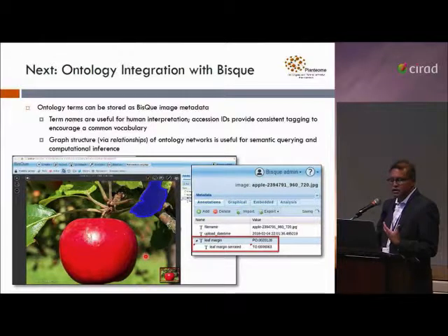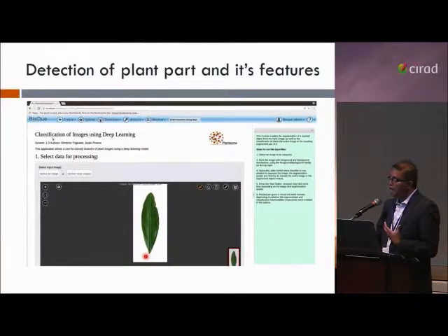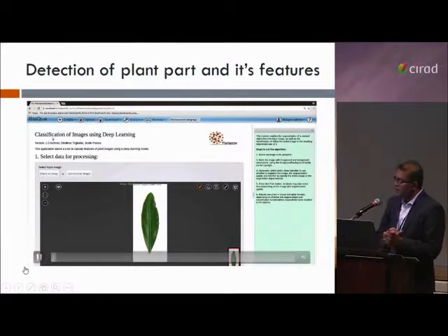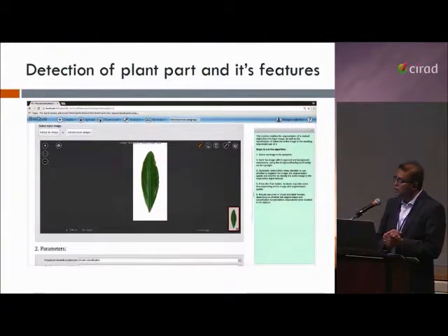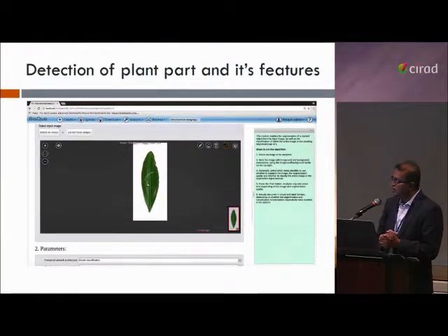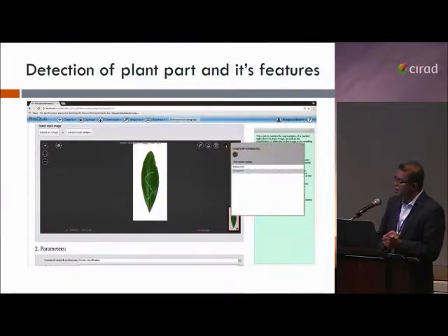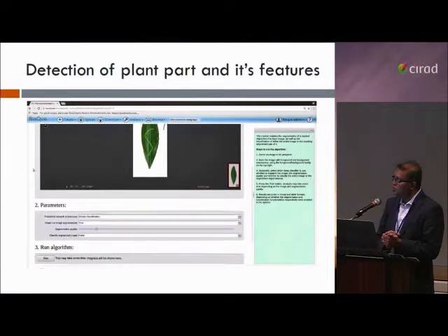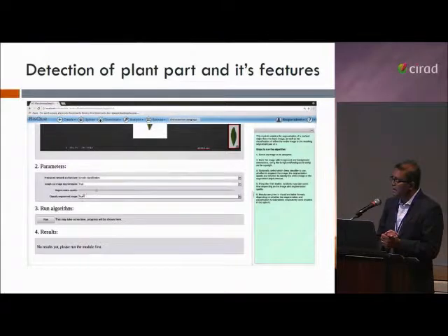So the tool is now running online, and hopefully, where is my mouse? So you can see a quick one. You select an image on the BisQue platform, upload it, and select the parameters, asking it for segmentation and identifying. So it's identifying its foreground, selecting its background. You have an option. If you don't want to use that option, then it will do it automatically.